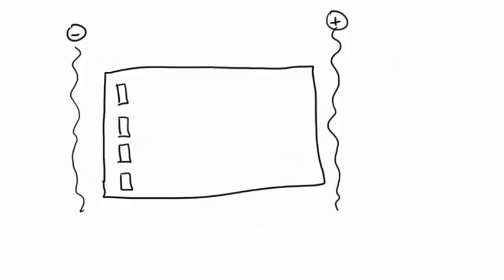So here we have another representation of this. So this square piece that you're seeing here, that's the actual gel that we're going to be having our molecules move through. And then within that gel, we have a series of holes which we call wells. And so these are really where we're going to actually load our samples. So we would put a solution that contains our molecules into those wells. And so I'm going to draw that here. And so we have a whole bunch of molecules in there.